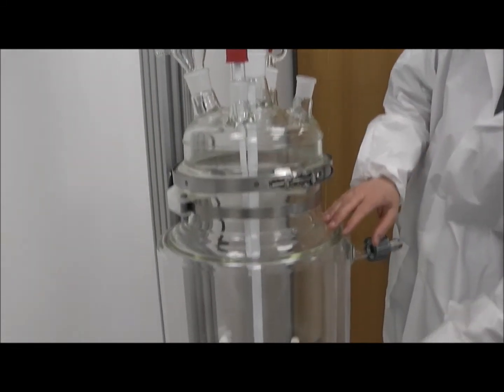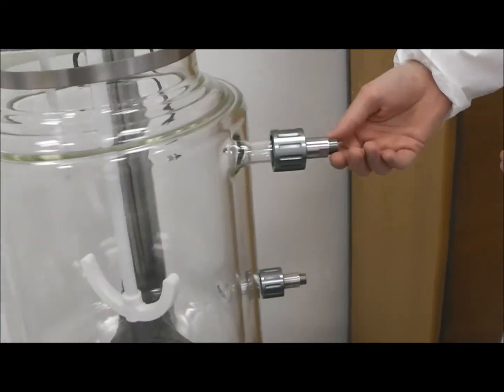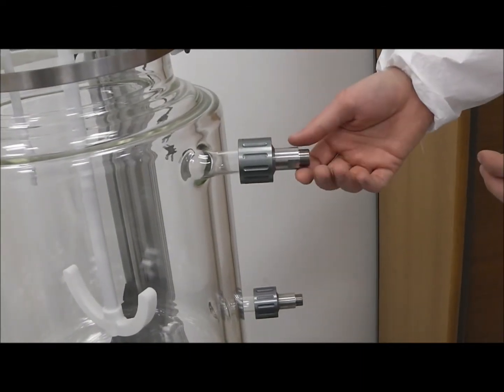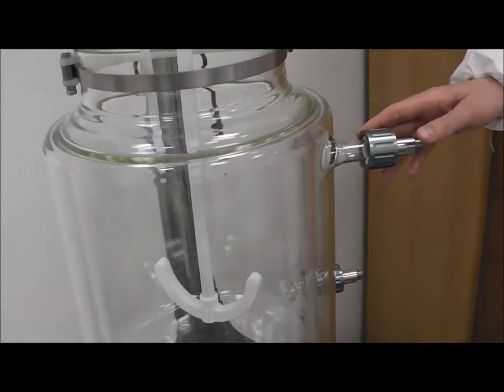This is a 15 litre jacketed reactor with M16 fittings, so you can bring your circulator up. Most oil pipes come with M16, and you can attach here — there's an in and there's obviously an out.